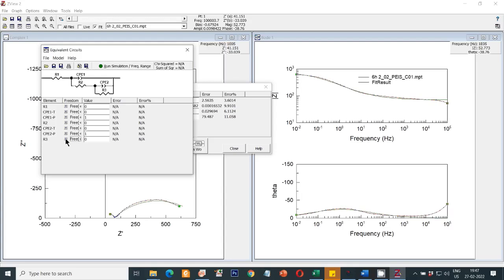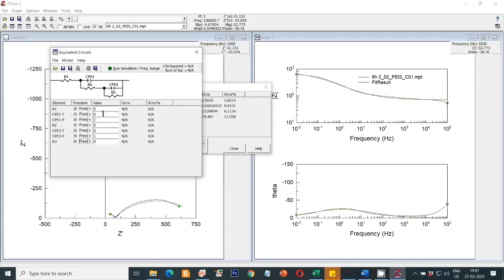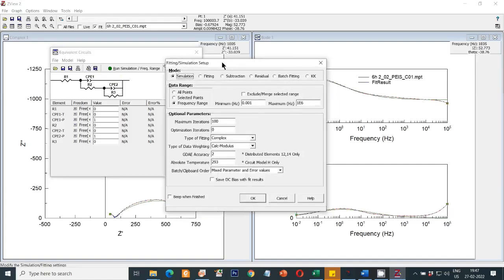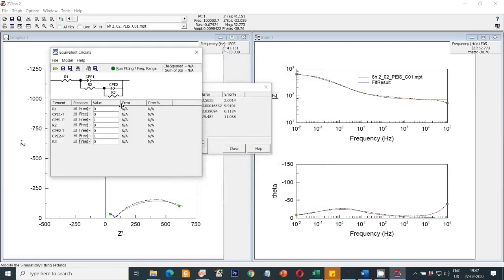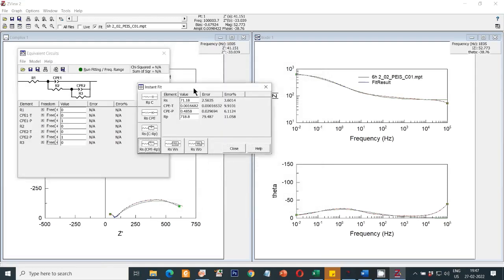You have to give some initial values, otherwise the fitting will not work. Go to Edit Fit Parameters. First select the frequency range as per your experiments — my experiment was performed from 100 kilohertz to 10 millihertz. Then select the fitting option, not the simulation option.